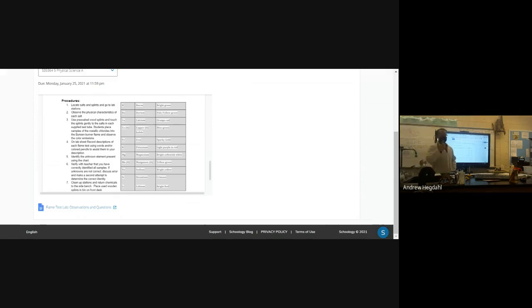So we have these different salts here, and some of them are much more distinct from one another than the others. For instance, these two have their own unique colors, and they're easy to distinguish. However, there's other salts in here that look really similar to one another. Like all of these are white, okay? But they have different textures.